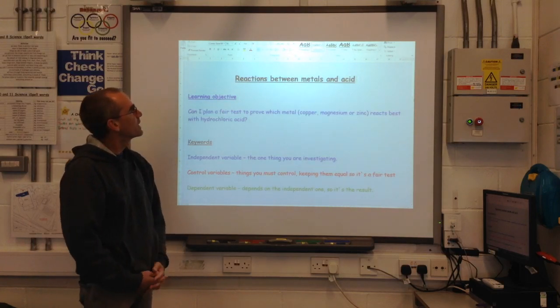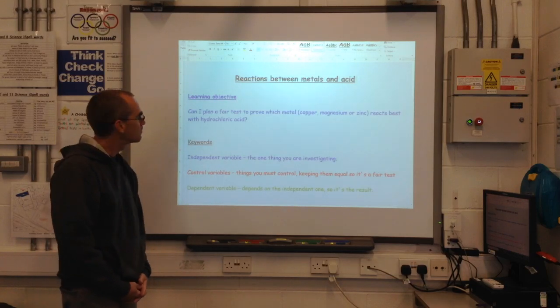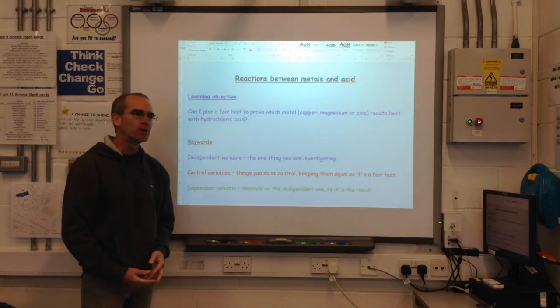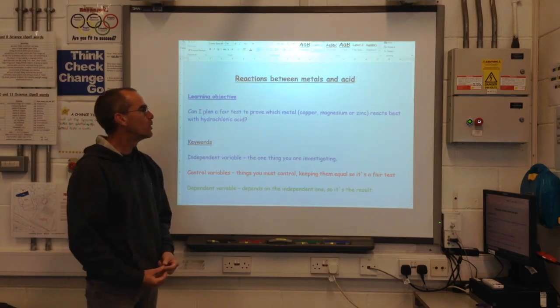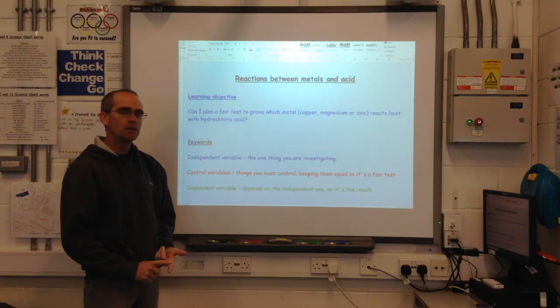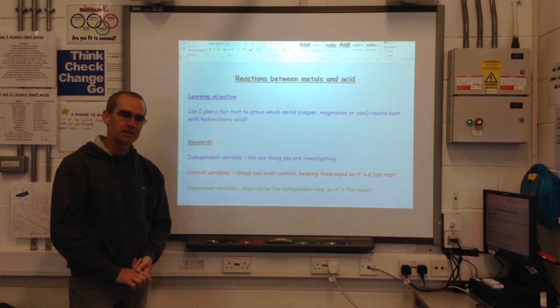Today we're going to be looking at the reactions between metals and hydrochloric acid. So similar to last time when we were looking at water, today I'd like you to be able to plan a fair test to prove which metal out of copper, magnesium and zinc reacts the best with hydrochloric acid.